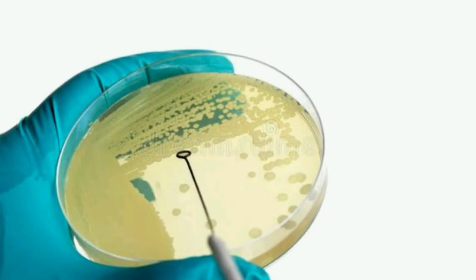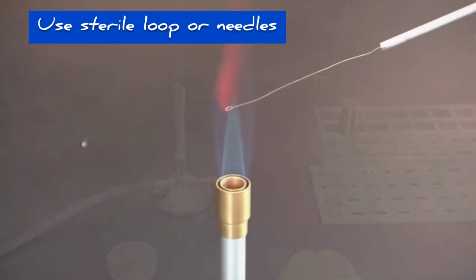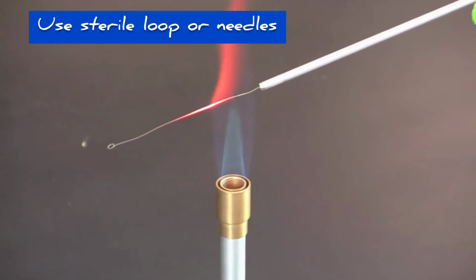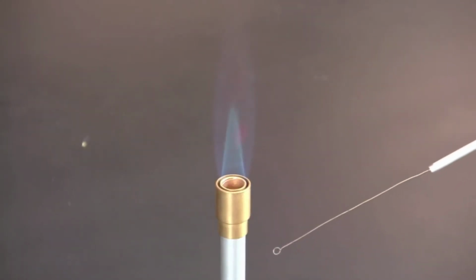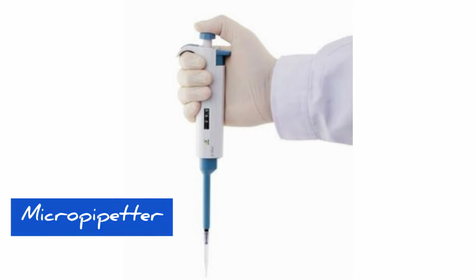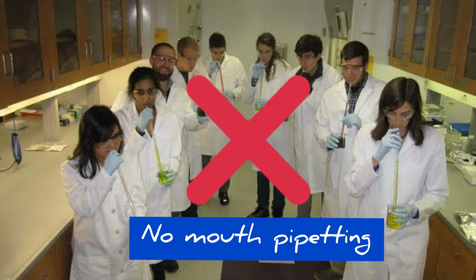Rule number 4. Most microbial cultures will be inoculated using a sterile loop or needle. Once the transfer is complete, the loop or needle should be sterilized again. Liquid cultures should be transferred using a sterile pipette and mechanical pipetting apparatus. No mouth pipetting is allowed in the laboratory, especially in a microbiological laboratory.